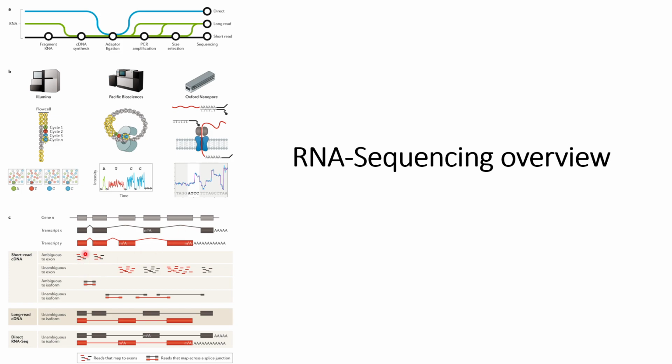The problem that might be caused with short read sequencing is that there are ambiguous sequences that might come from both transcripts, and it is not possible to clearly identify which read belongs to which transcript.